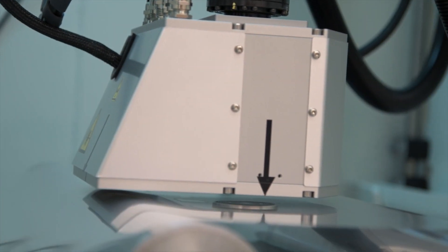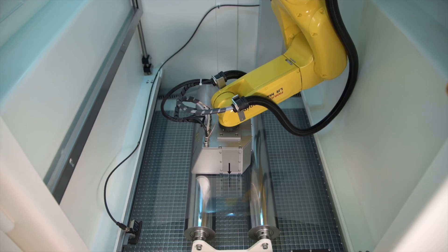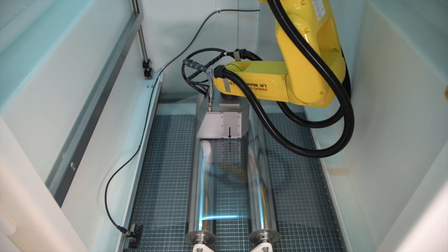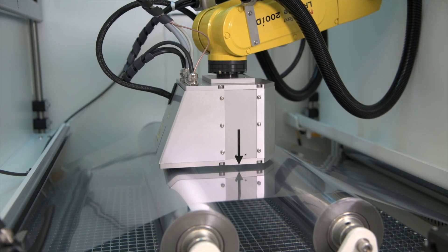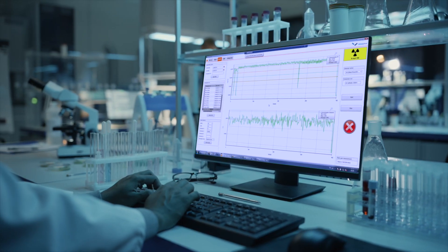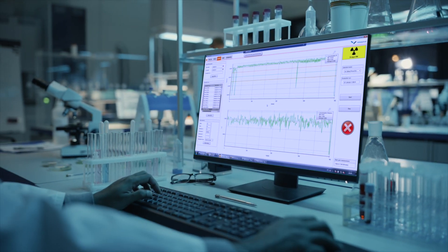Its unique robotic arm design enables precise height control for fully flexible on-product inspection, giving you the best reproducibility possible and automatic validation ensures your data is consistently high quality.